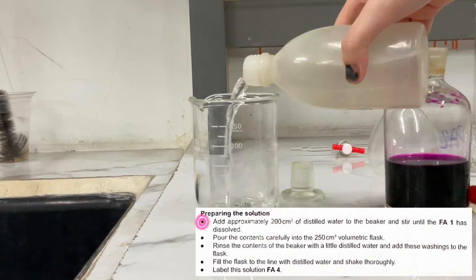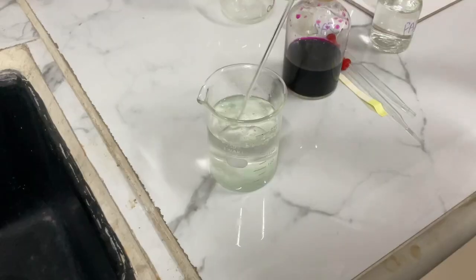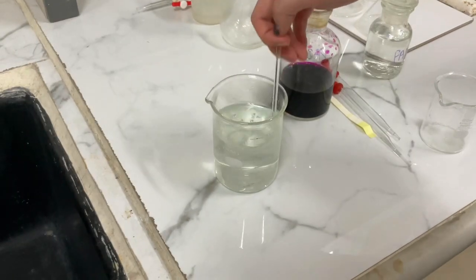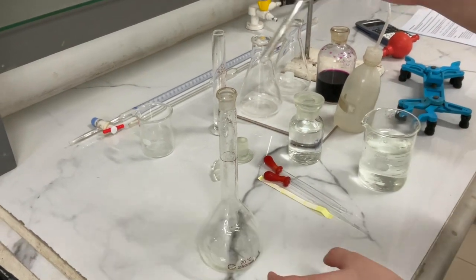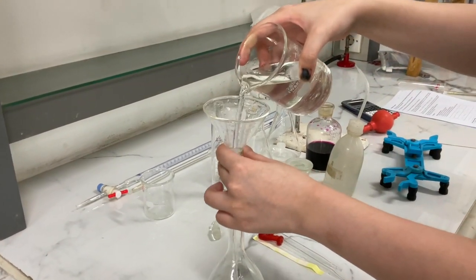Preparing the solution. First, add approximately 200 cm³ of distilled water to the beaker and stir until the FA1 has dissolved. Be sure to stir until the solution is completely clear. Pour the contents carefully into the 250 cm³ volumetric flask and use a funnel to prevent any spillage.